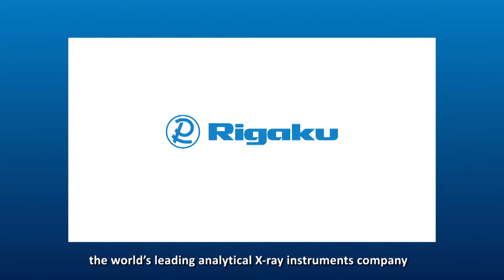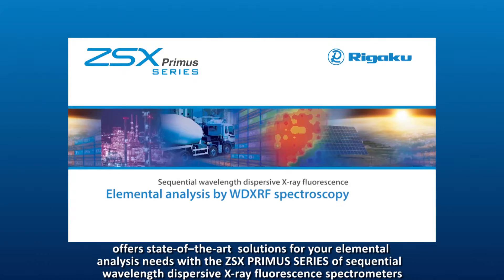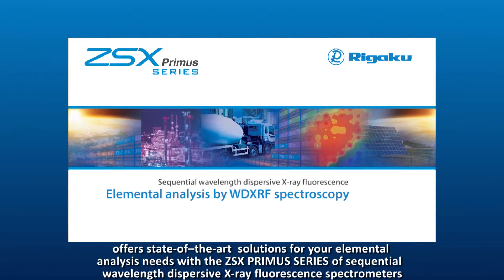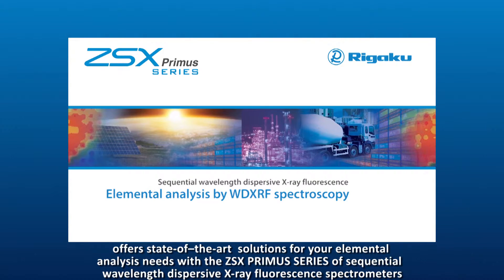RIGAKU, the world's leading analytical X-ray instruments company, offers state-of-the-art solutions for your elemental analysis needs with the ZSX Primus series of sequential wavelength dispersive X-ray fluorescent spectrometers.